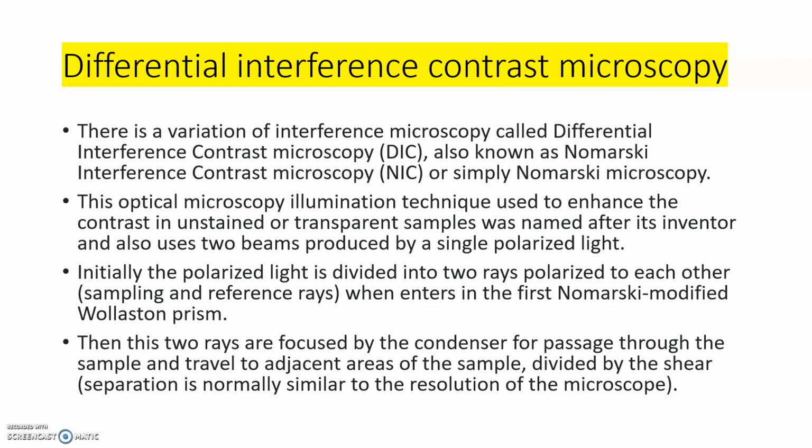Initially, the polarized light is divided into two rays polarized perpendicular to each other, sample and reference, and this enters the first Nomarski modified Wollaston prism.